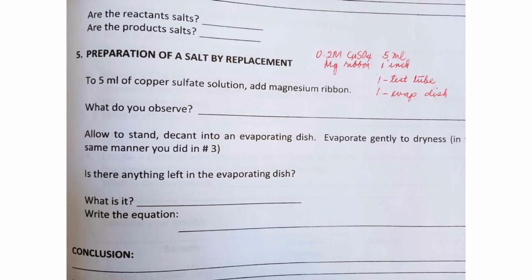Next is preparation of salt by replacement or single displacement. So this involves copper sulfate solution and magnesium ribbon. Now, I'd like to share with you a video.